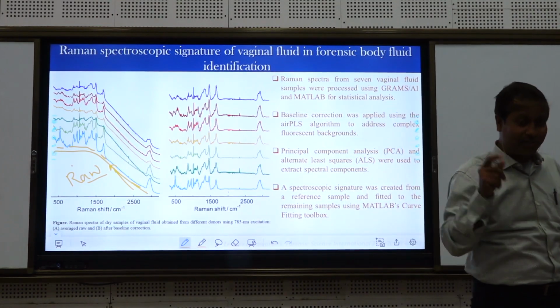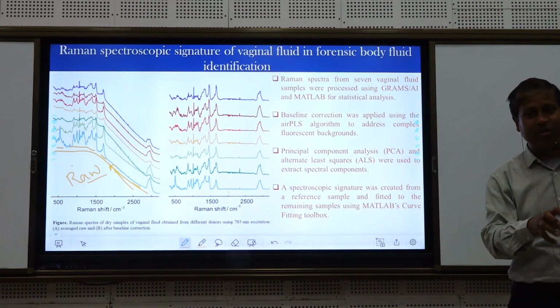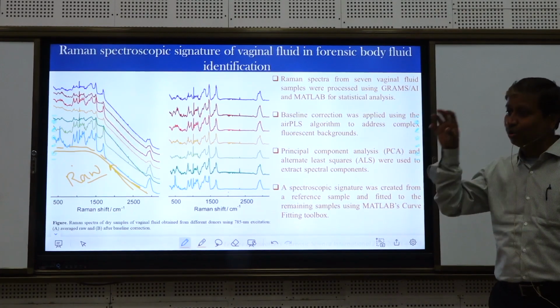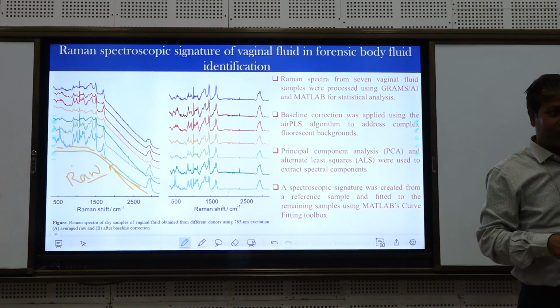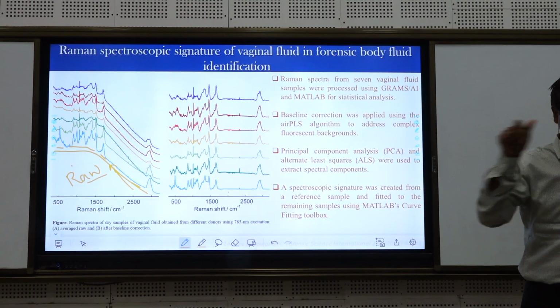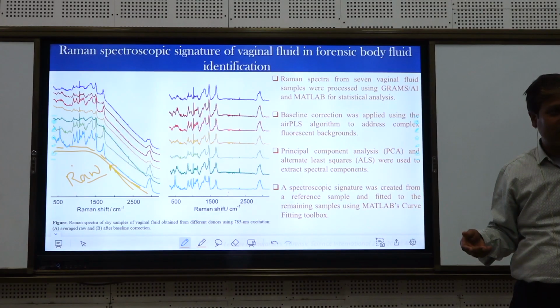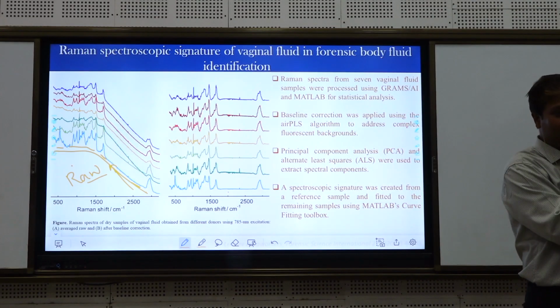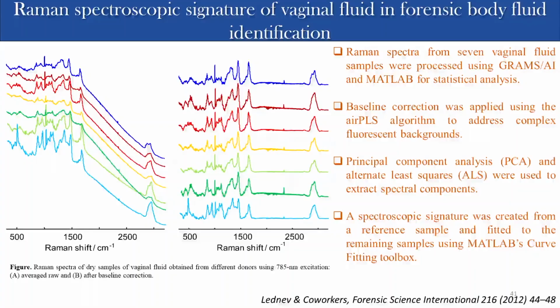That is why there are some groups who do only this, and based on their work, those formulations will be there in your machine. The program allows you to do this kind of operation. So where does this program come from? The instrument manufacturer purchases that software from them.